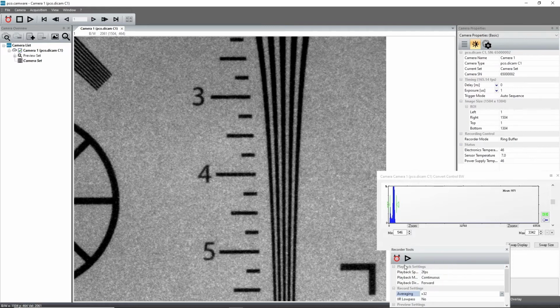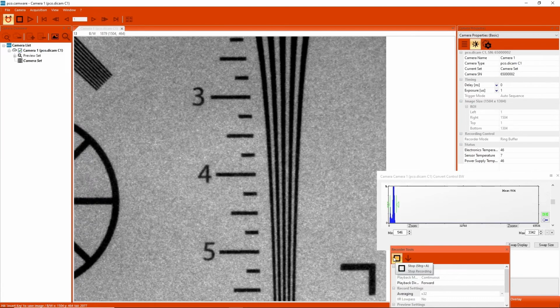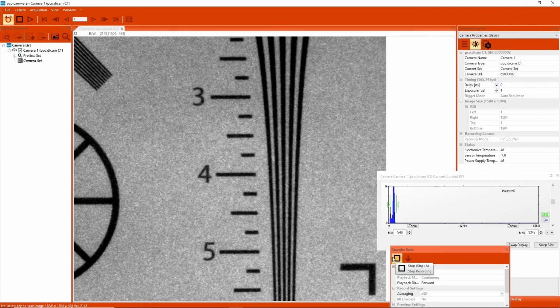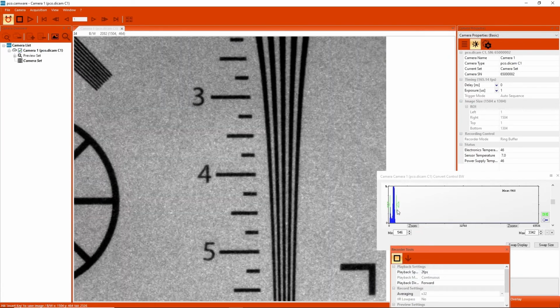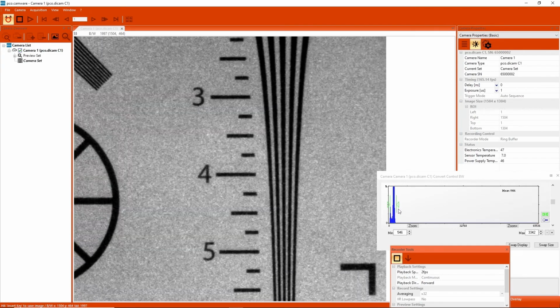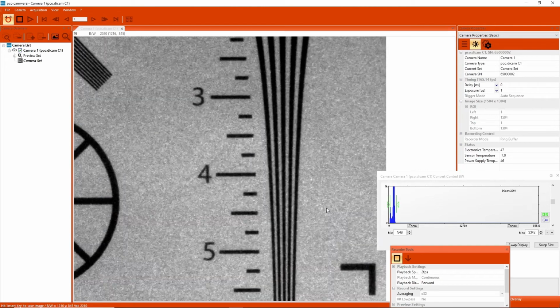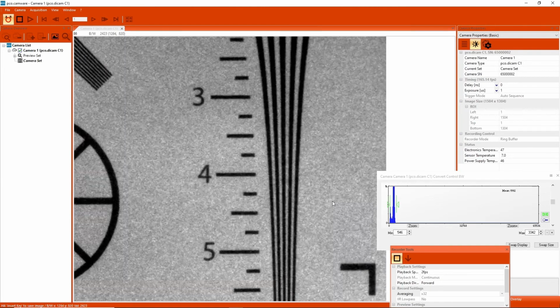And I will still get 5 updates per second. Let's do it. Watch now the image quality. Although the mean signal is still the same, the images are much less grainy. We have, to a certain extent, averaged out the shot noise.